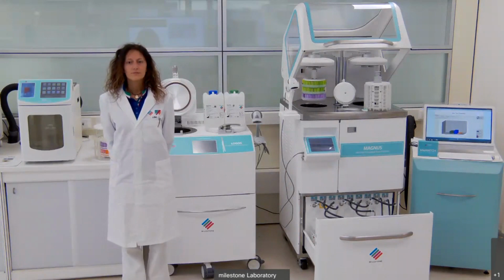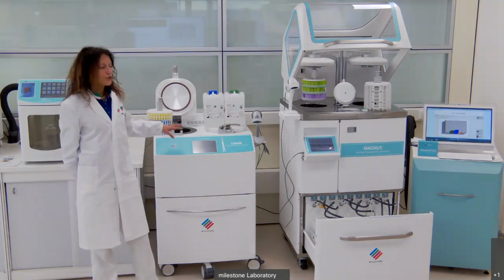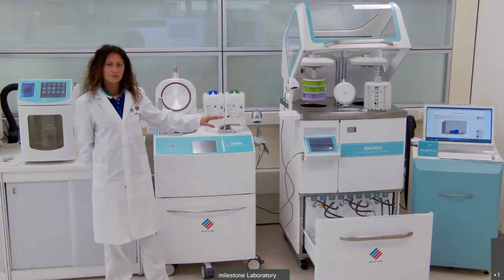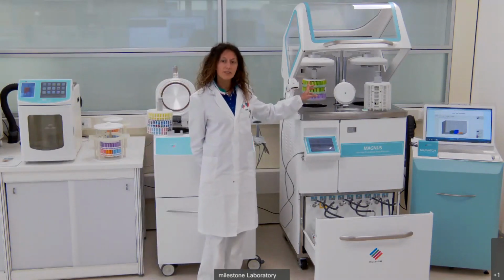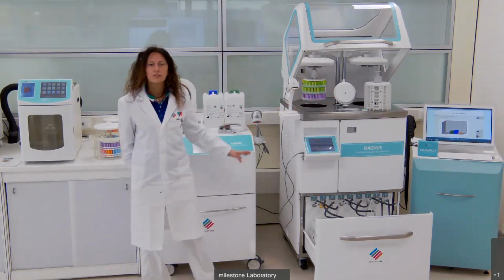Okay, now there's a question which says, what are the main differences between Magnus and Logos? Logos and Magnus are both automatic processors and both allow the lean loading. The big difference is that in Magnus the robotic movement has been added. So the 2 robotic arms allow the processing from fixation to wax impregnation in an independent way and also allow the lean loading.